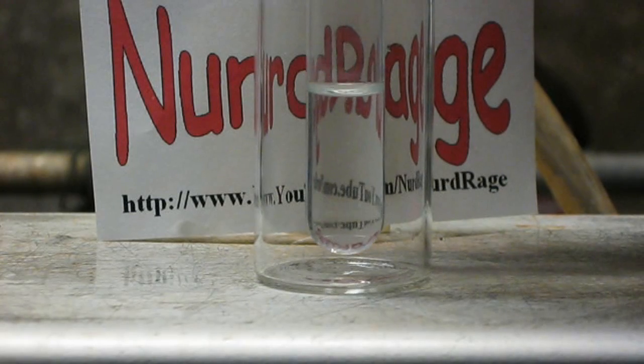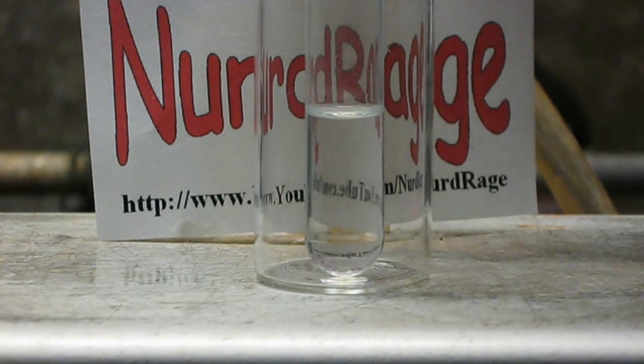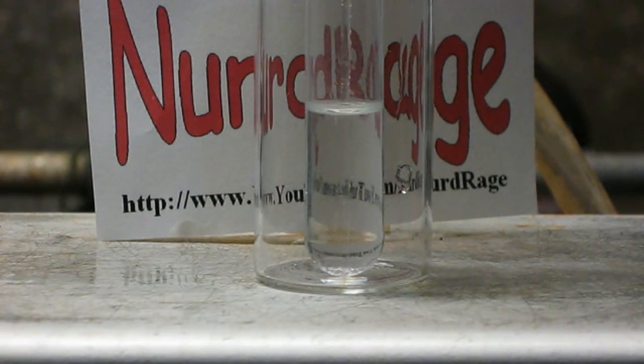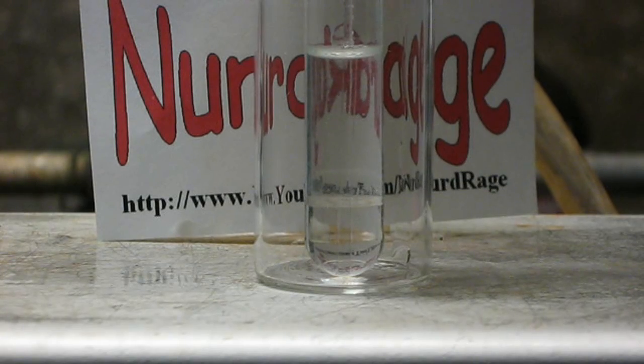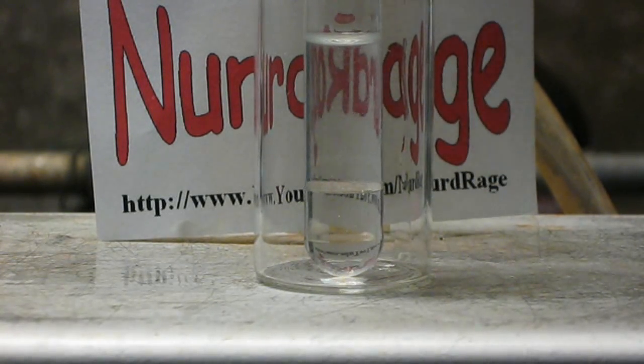Just get a tube of 95% alcohol. I've found that the more expensive pure alcohol actually doesn't work as well as this cheap 95% stuff. Now, with a pipette, carefully inject a layer of concentrated sulfuric acid into the bottom of the tube. Do not let the layers mix or this won't work.